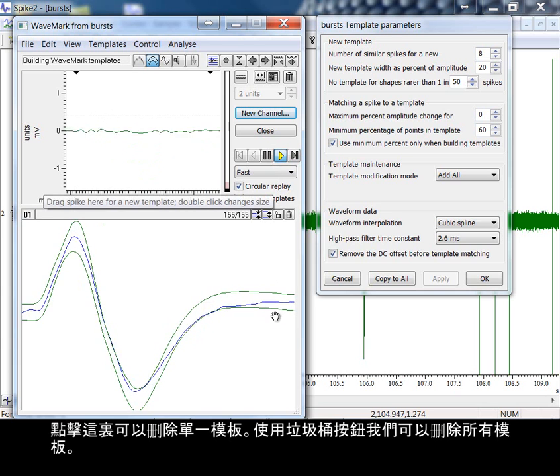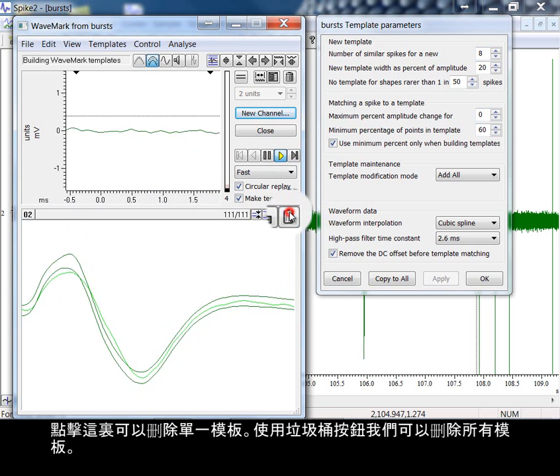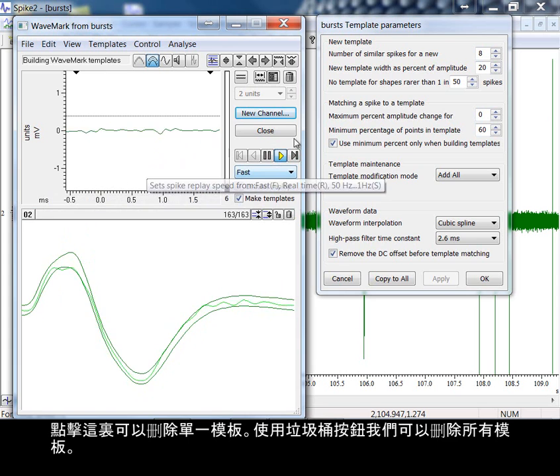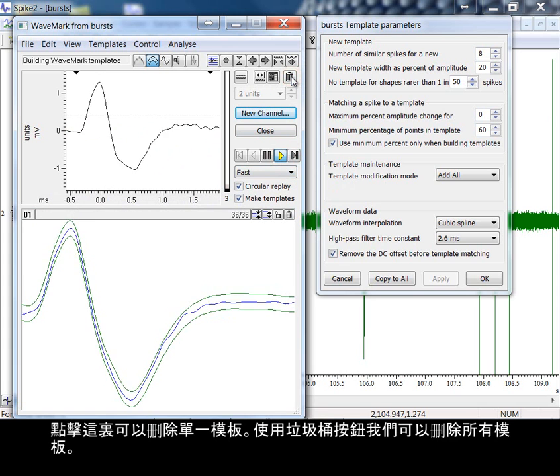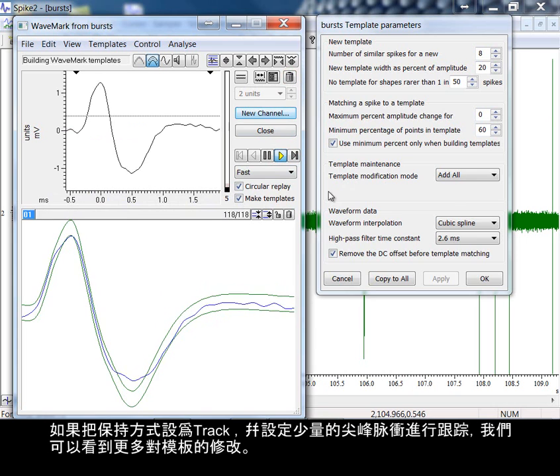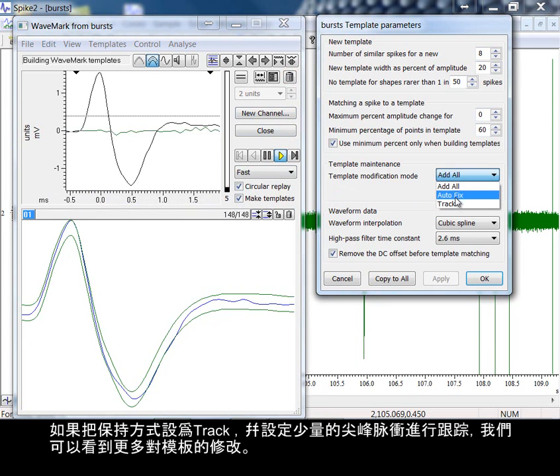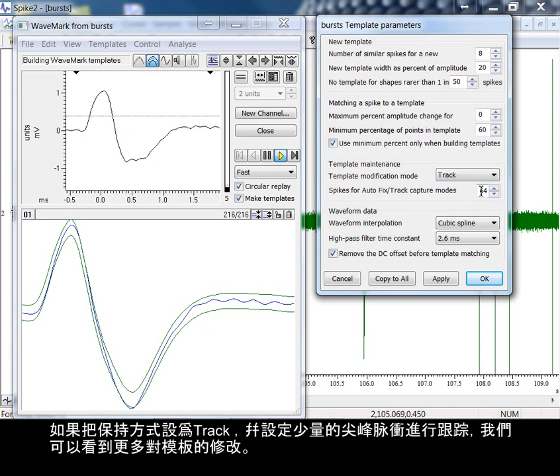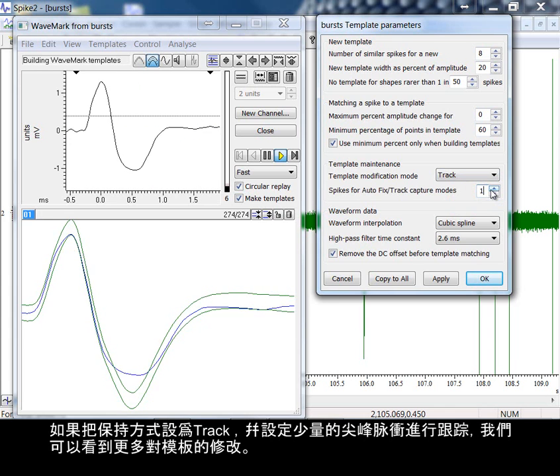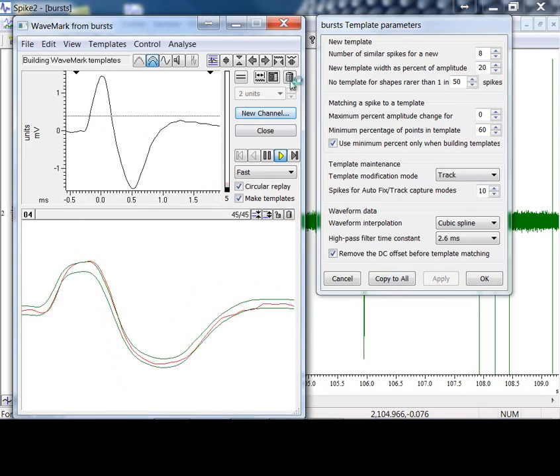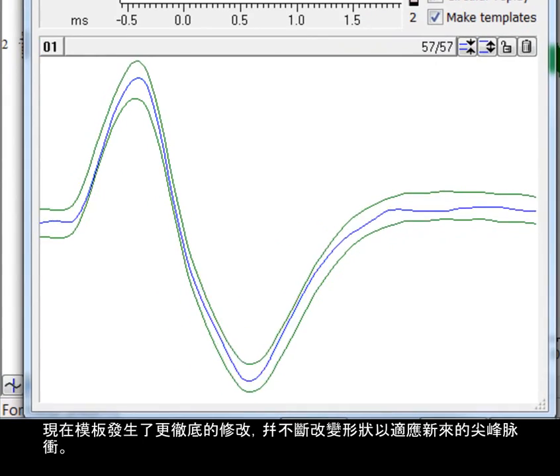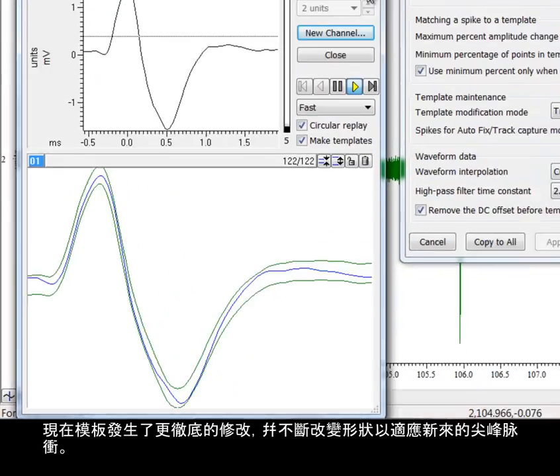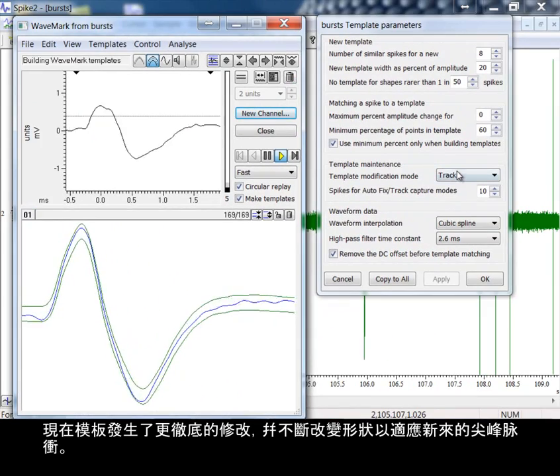To delete a single template, I click here. To delete all templates, we use this trashcan button. Much more modification of the template will be seen if we set the maintenance mode to track and set a low number of spikes to follow. The template is now being modified more radically and changes shape to accommodate the incoming spikes.